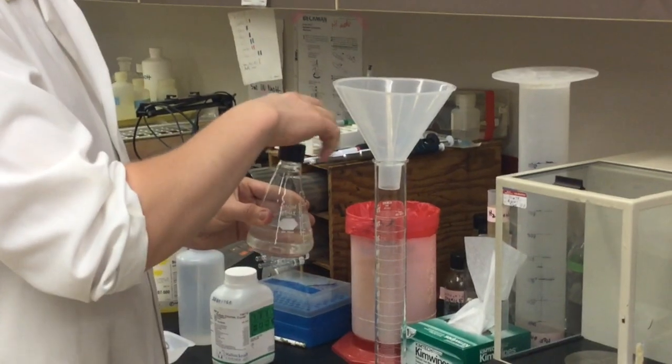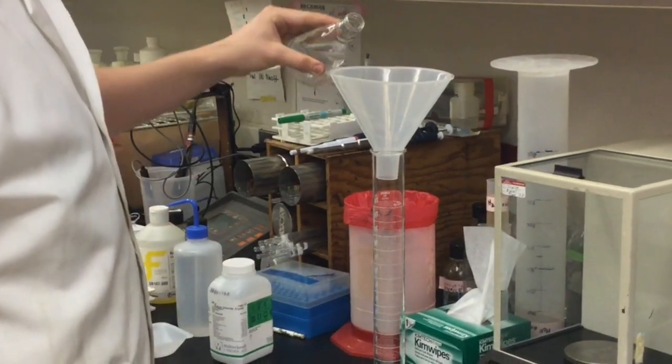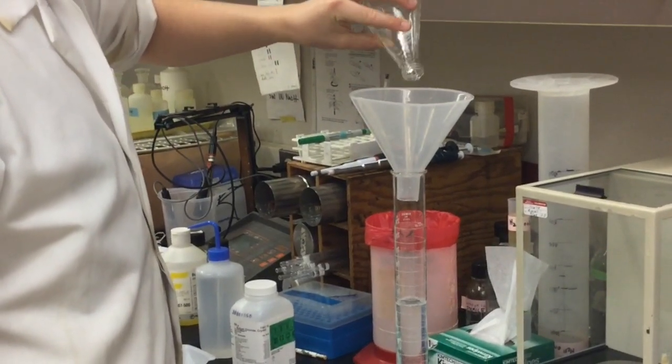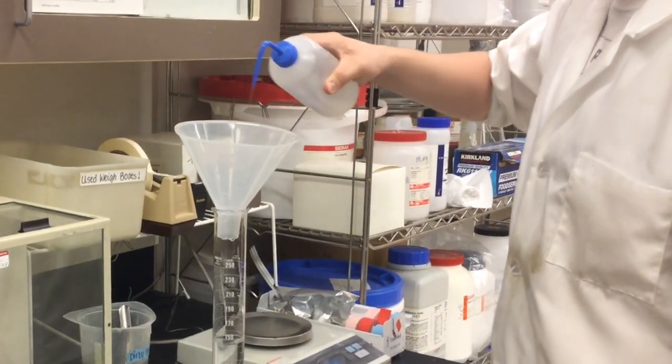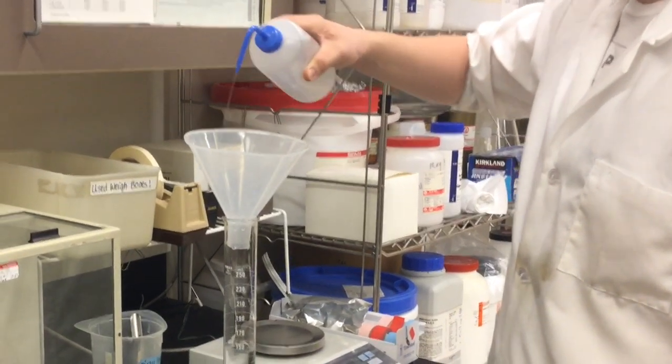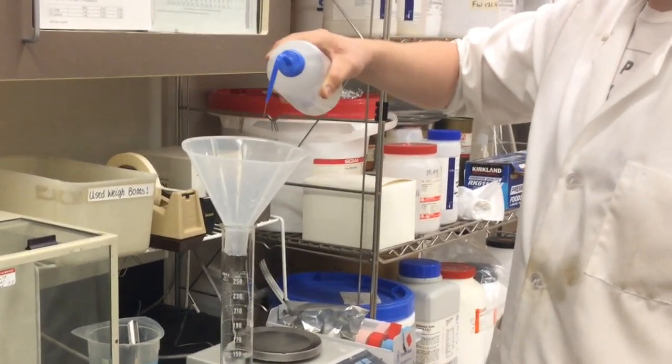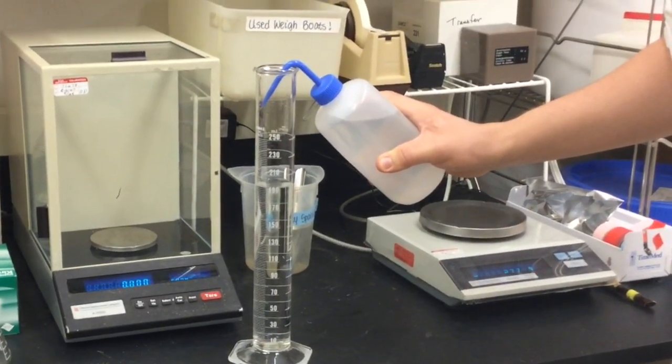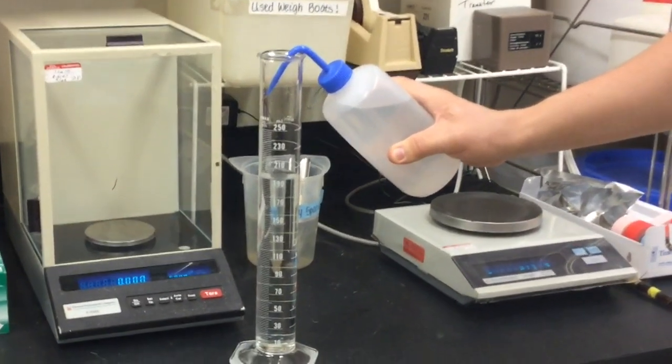Transfer your solution to the graduated cylinder using the funnel. Use the squirt bottle to rinse the funnel in order to get any remaining crystals from it. Use the squirt bottle to add nano-pure water to the graduated cylinder until the meniscus touches the 200 milliliters line.